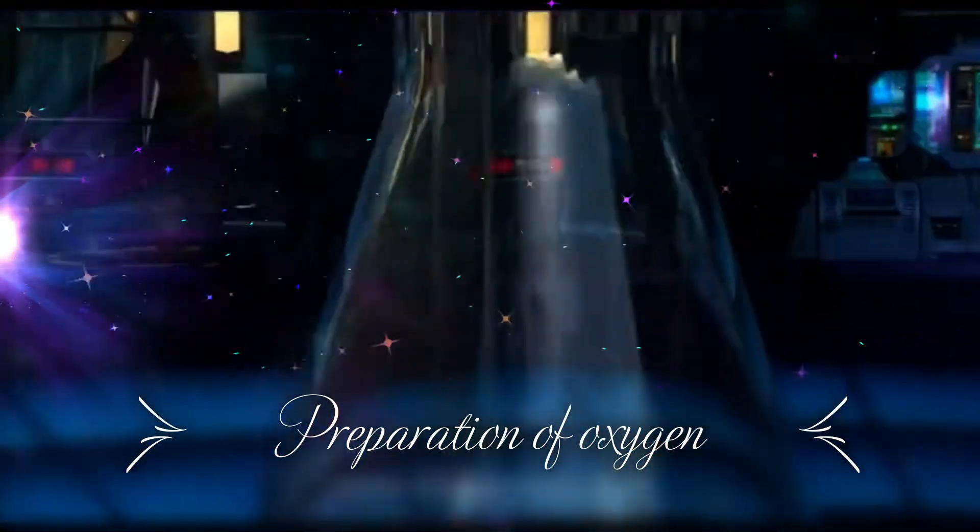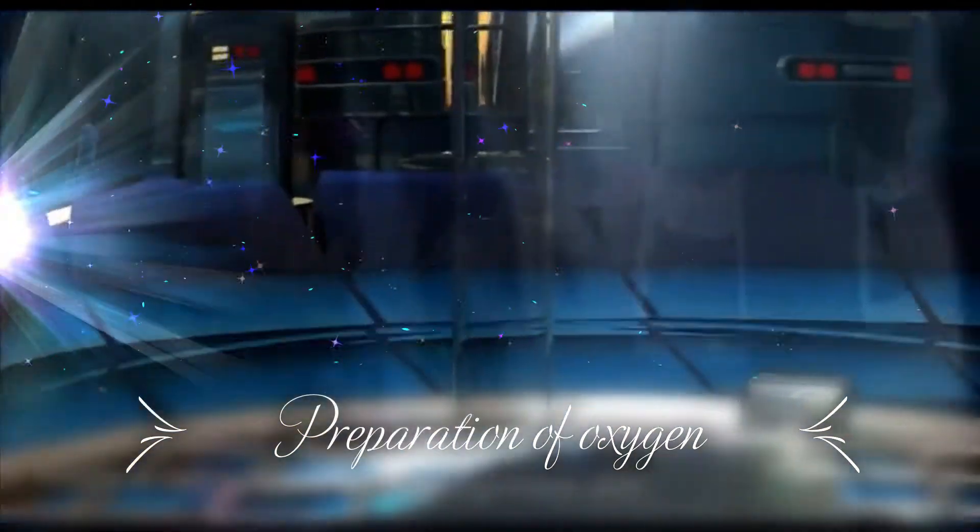Now, allow hydrogen peroxide to be added dropwise into manganese dioxide.